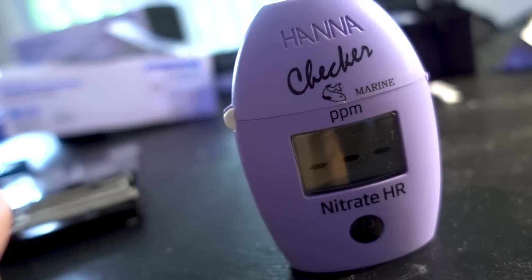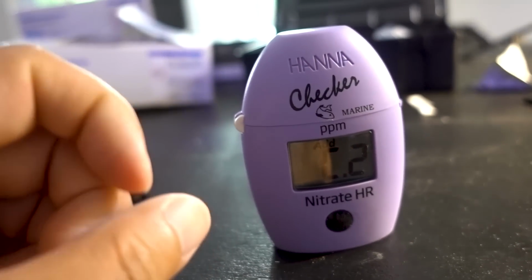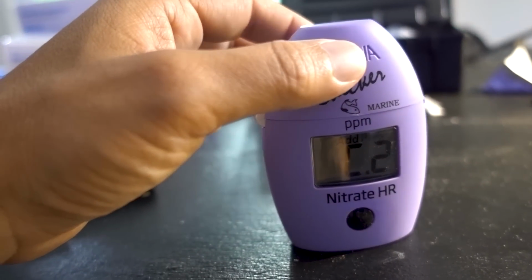Oh, I actually have a really nice click this time, versus a lot of the other Hanna checkers. I push it in, and I'm like, oh, I'm not sure if the lid is closed tightly. So that's a nice little improvement.